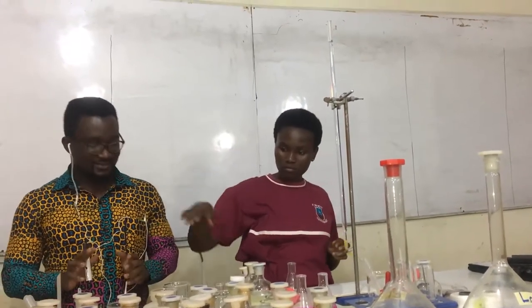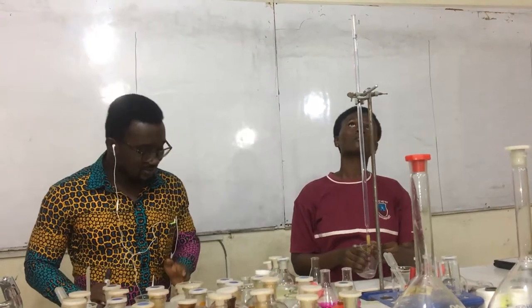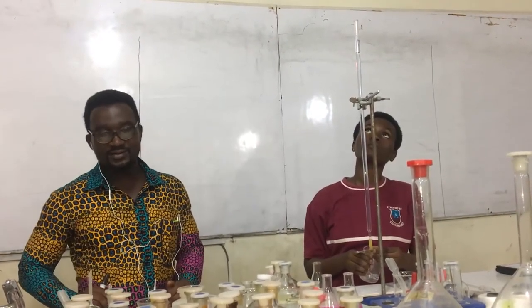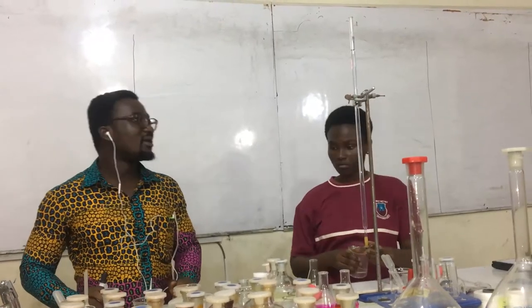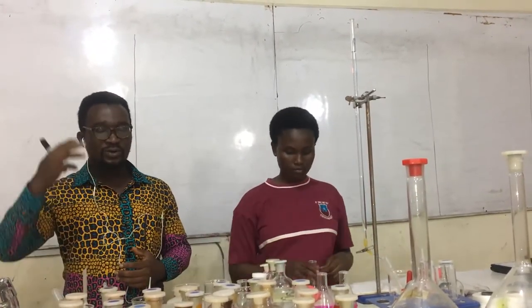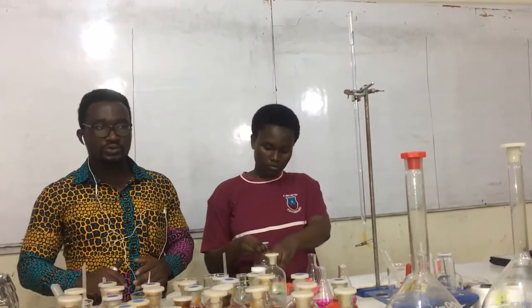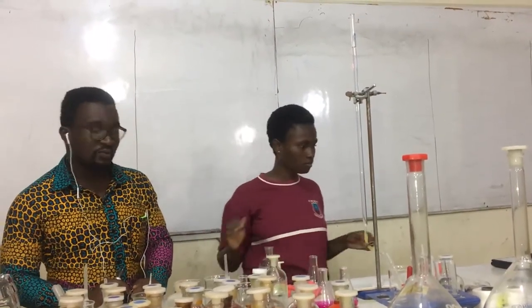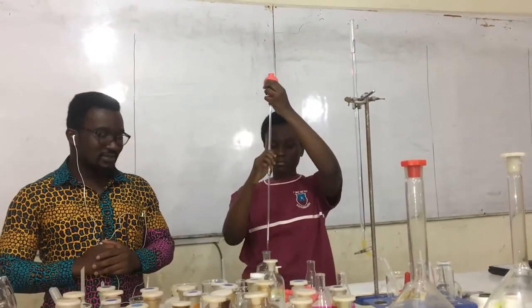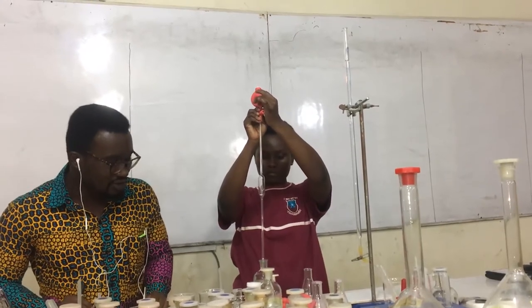You also recognize that before she starts her titration, she picks the funnel out from the burette. And then the second thing that she does is to regulate the volume. Flush out the bubbles to regulate the volume. That is what she does always before she starts with the normal titration.